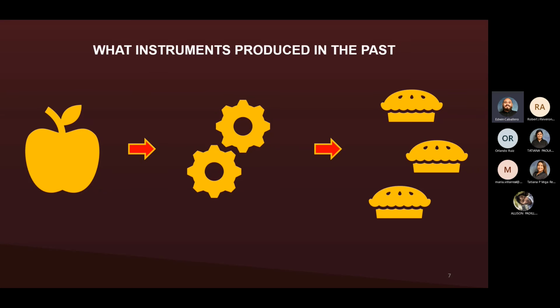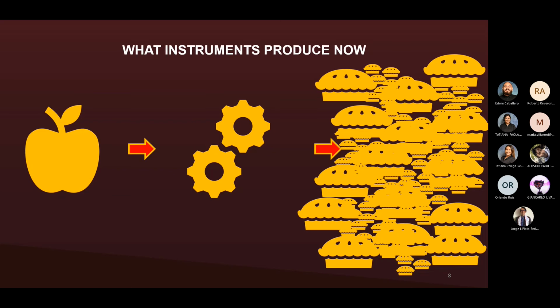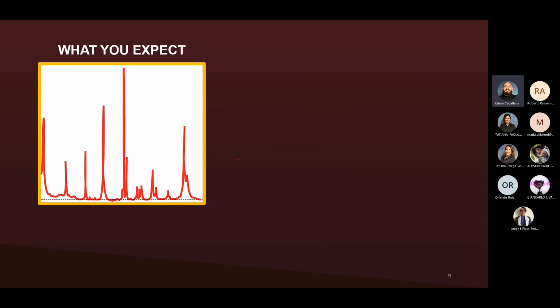And with the progress in years, we have seen that even more data is being able to be collected. And thanks to that, also some instruments have become more accessible. So even more students can use them, even more personnel, and all of that, which is great. However, due to a lot of people now starting to use more instruments, they're going to face a little bit of roadblocks, some plateaus when they try to analyze their data.